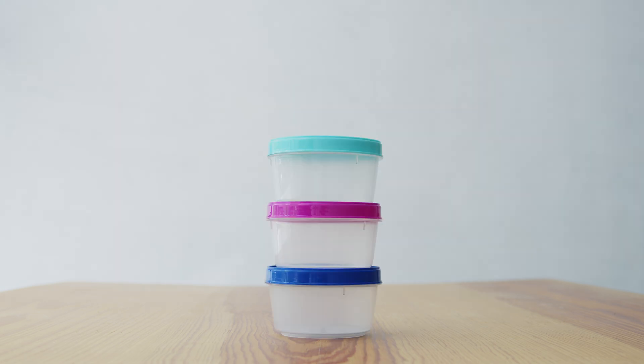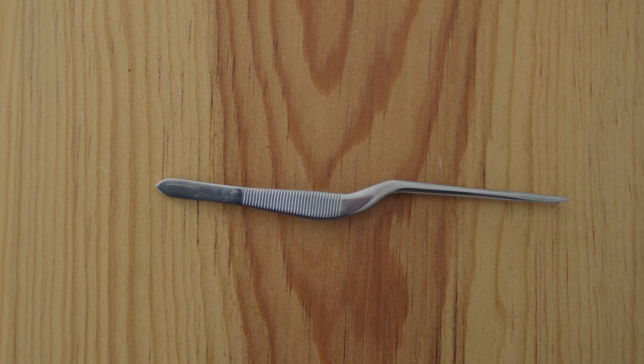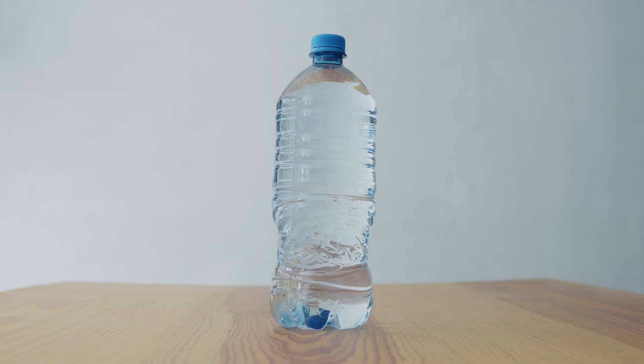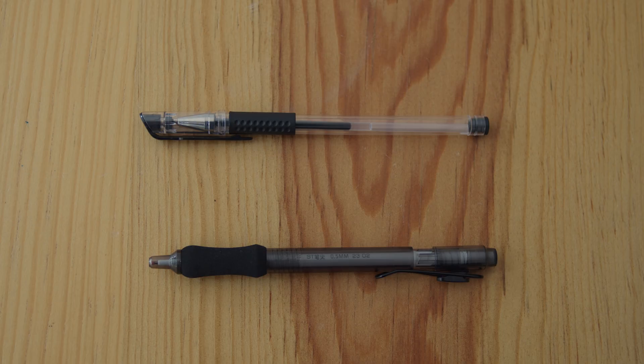A food safe, odorless container of 180 to 240 milliliters, equivalent to 3 quarters to 1 cup, sealed with a lid. A half teaspoon with standard capacity of 2.5 milliliters. A pair of food safe tweezers. Spit and rinse cups. Water at ambient temperature. An evaluation form, found in Chapter 20 of the guide. A pen with unscented ink.